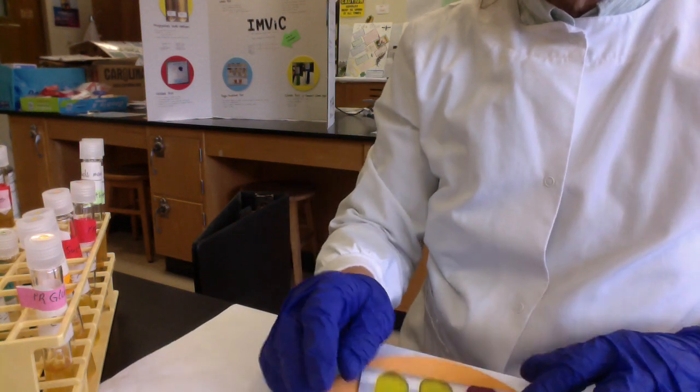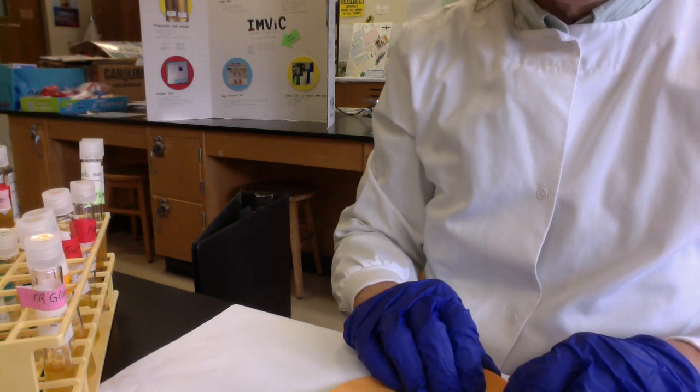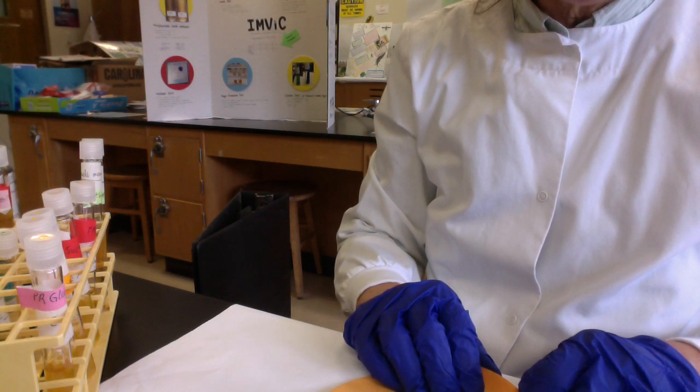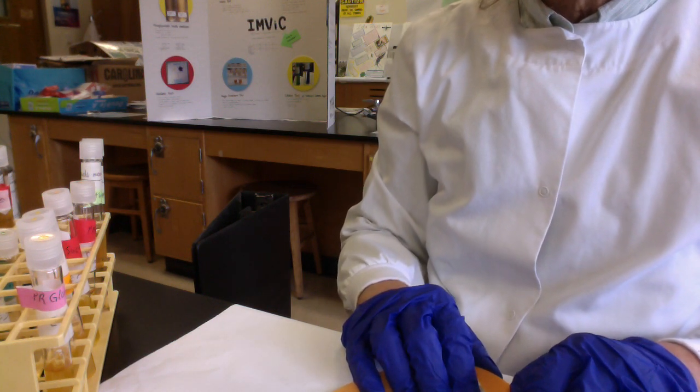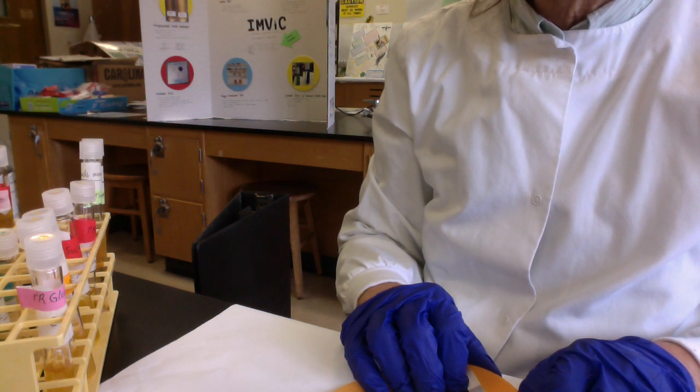Hi micro folks, we're here doing our coronavirus videos and these are for our lab results. We inoculated our tests 48 hours ago, so we're looking at our test results. This is for Chapter 16, metabolic test part 1.